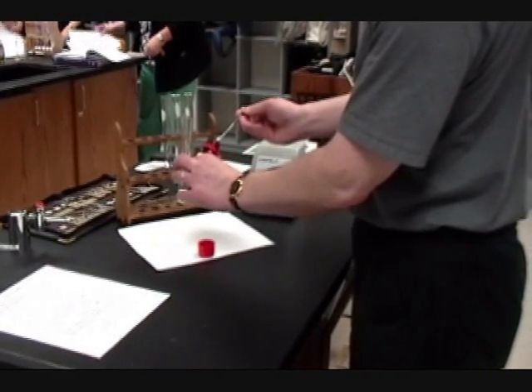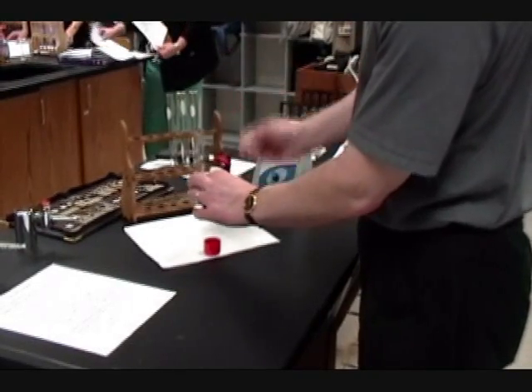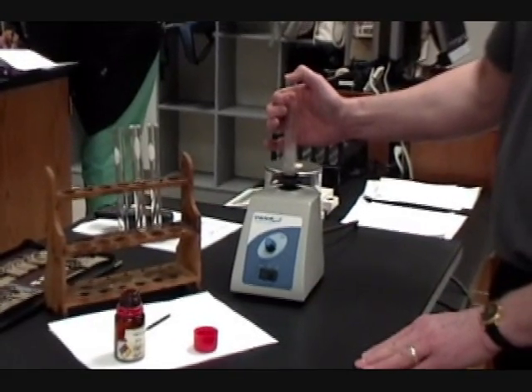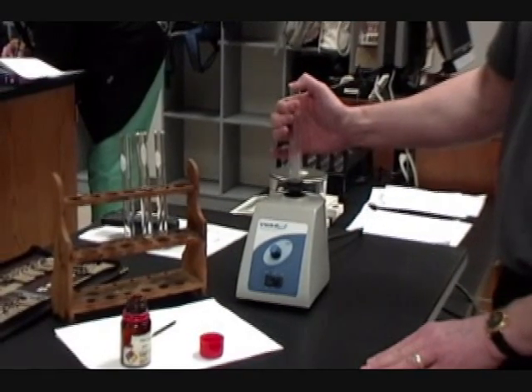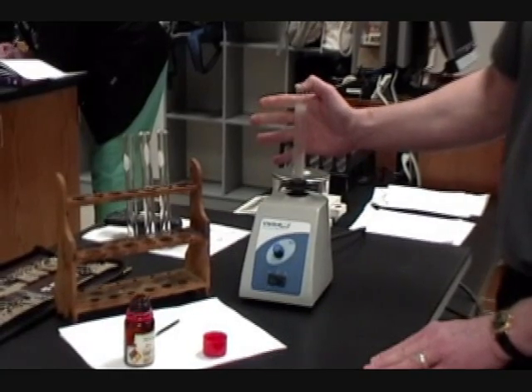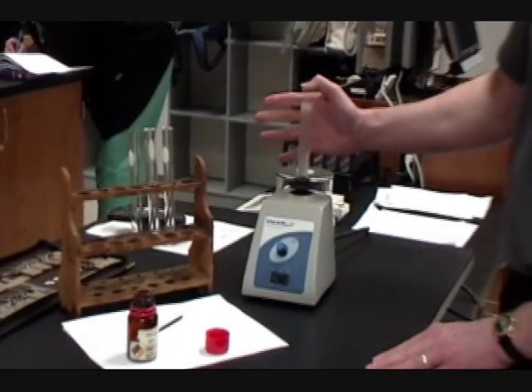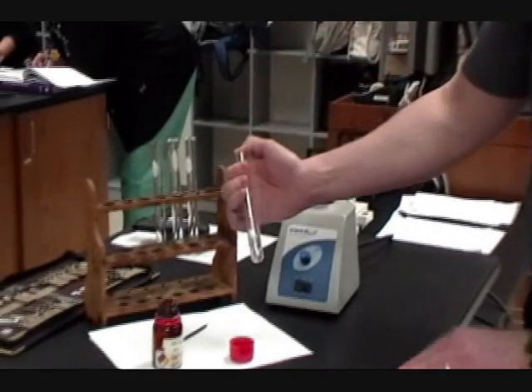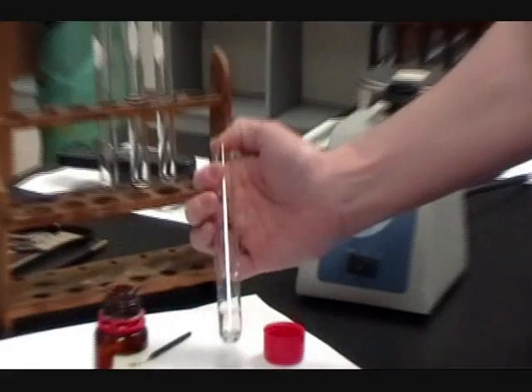Carefully place the test tube into the rubber holder on the top, and with some light pressure on the top of the test tube, push down and allow that vortex motion to dissolve the ammonium chloride. Keep it pressed down and mixing for about 20 seconds at a time. Look at your sample and ask yourself, has the ammonium chloride dissolved? If it has, then you have to keep adding more, vortex it for some more time, and you'll keep adding ammonium chloride and then vortexing.